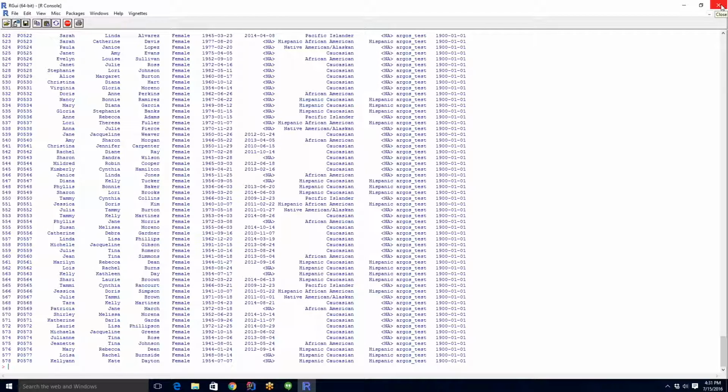So now LabKey is using the same activity, IRB, and PHI level that I had specified previously within my browser to customize its use within R.